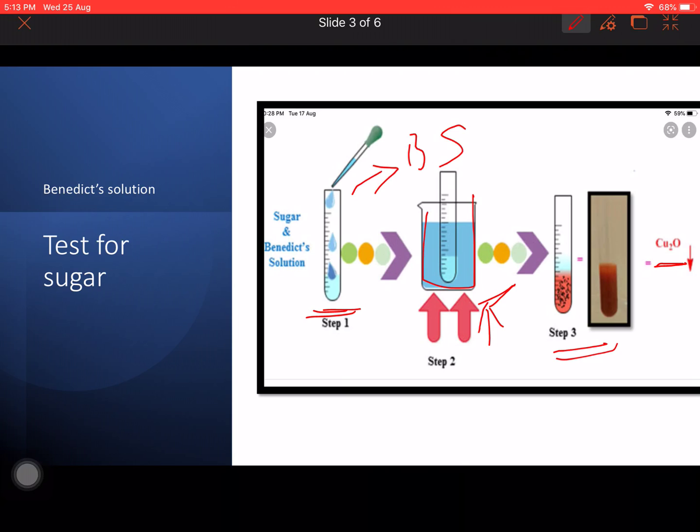However, if in place of this we take tamarind, gourd or lemon, they do not show any red color after heating them on a slow burner or in a water bath. Strong heat is not recommended for this experiment.